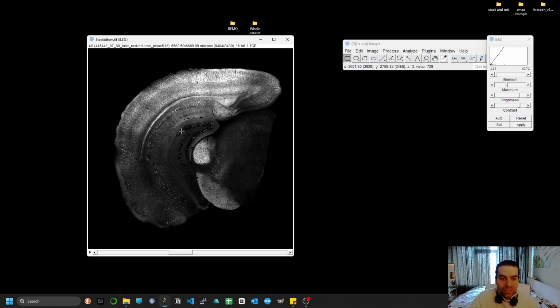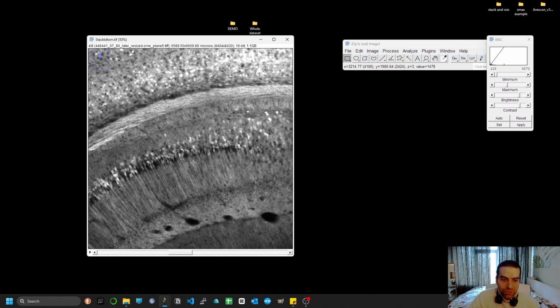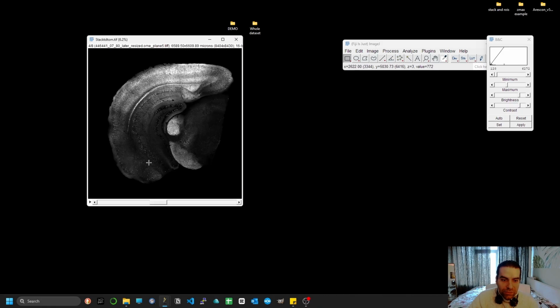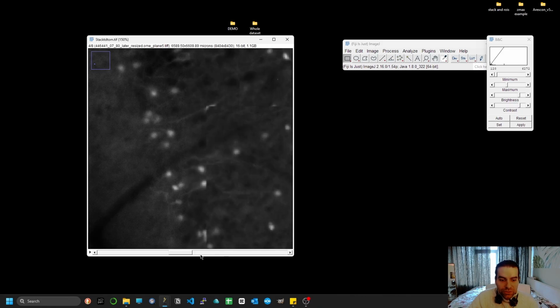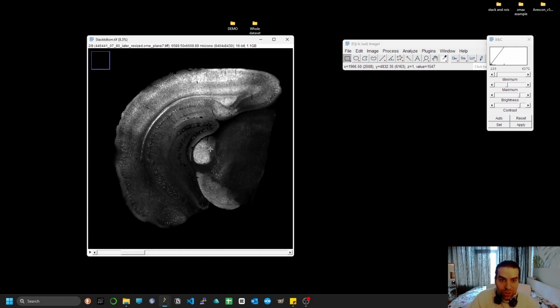And the reason we're doing it is because, as you can see, there are parts that you can have pretty well focused on one plane, but if you shift to another plane, you can see that the focus is lost, and you need to actually capture more points in order to make sure that you will have at least one crisp version of your cell's nuclei or whatever. So this is the first step to combat the problem of objects not perfectly aligned on a particular surface, which is pretty much never the case, at least hasn't been for me so far. There are many factors that can lead to that.